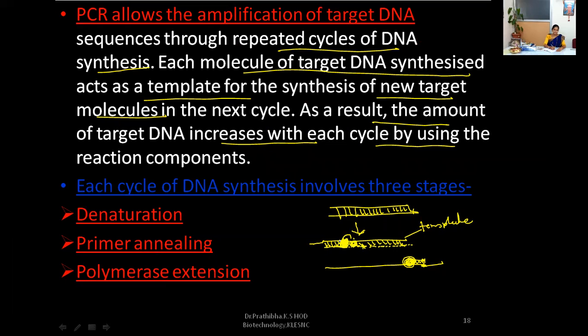So this Taq DNA polymerase is going to add the individual nucleotides according to the template DNA. And here also, this will add the individual nucleotides according to the template DNA as and when this particular Taq DNA polymerase moves in this direction, and here in this direction. Once after the synthesis, next what happens? This particular Taq DNA polymerase will detach from that particular DNA molecule.